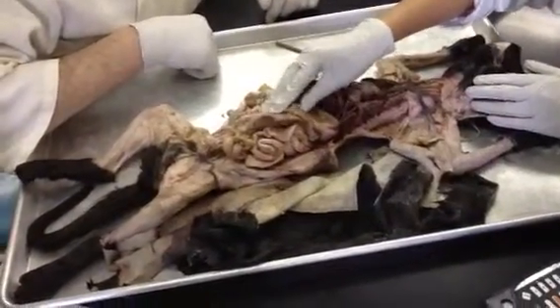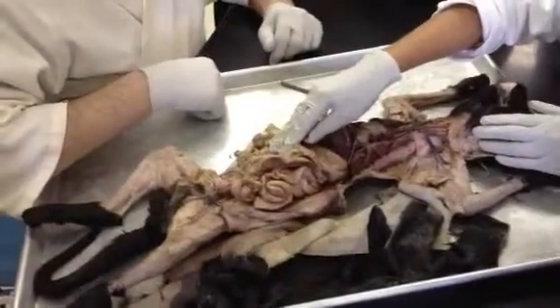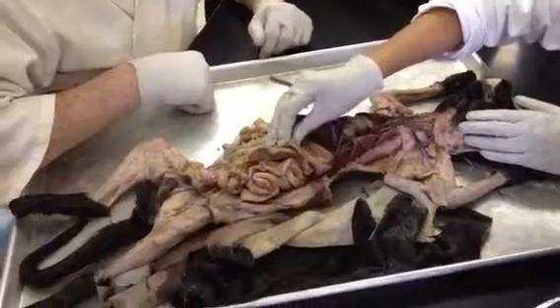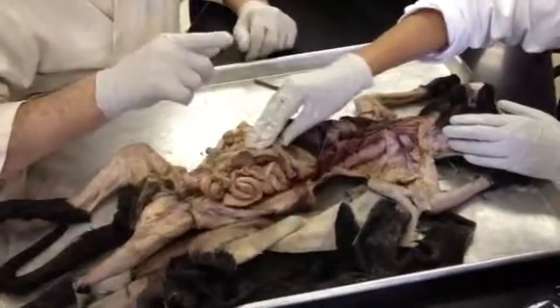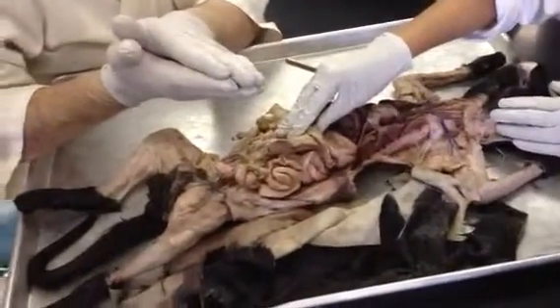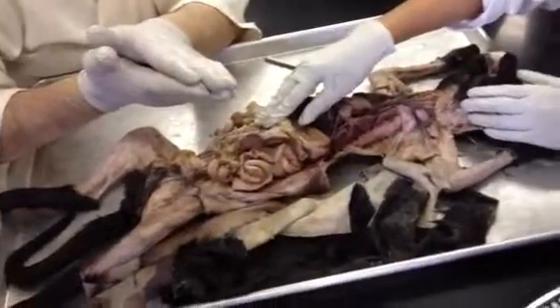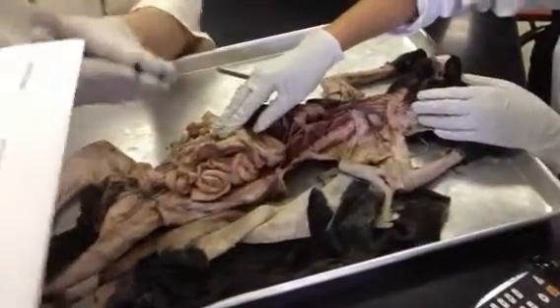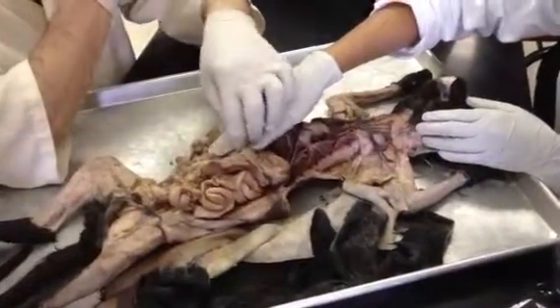But it itself is mesentery. It's made out of a double layer of mesentery. A mesentery is 2 layers of serous membrane, but this mesentery is folded back, so you have a double layer. So you have 4 layers of serous membrane, and in between there's a cavity inside where the fat's located.